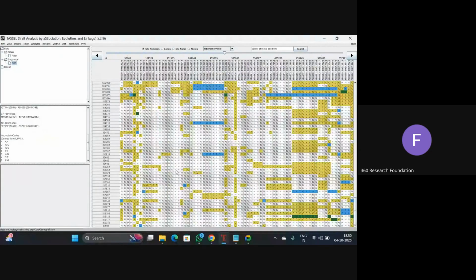So first of all, we need to clear these missing values, and we need to clear the alleles or markers having less than 5% heterozygosity and less than 5% variability. This heterozygosity and variability is calculated across the 244 accessions. On that basis, now we will do the filtering of that file.